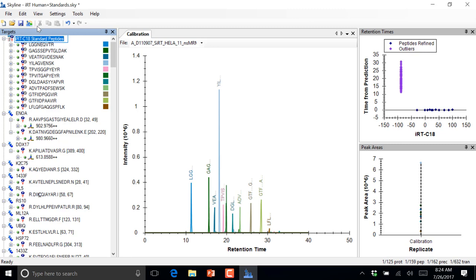And you'll notice up at the top, just like last time when we made a mistake and we measured peptides twice, in this case we get the file drop down and it's actually the correct case where we are expecting our IRTs to be in both files, right? It would be a bad thing if we didn't have measurements for the IRT peptides in both files. So that's one thing that Skyline will do for you.